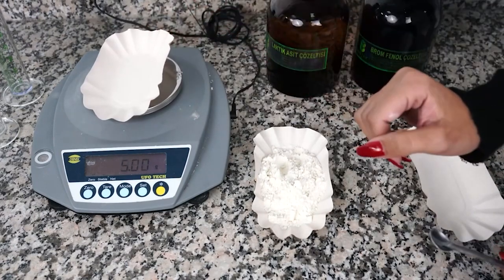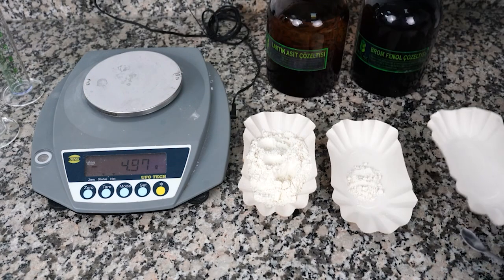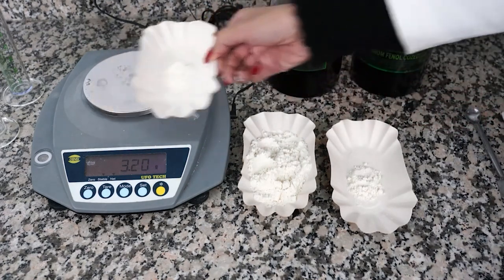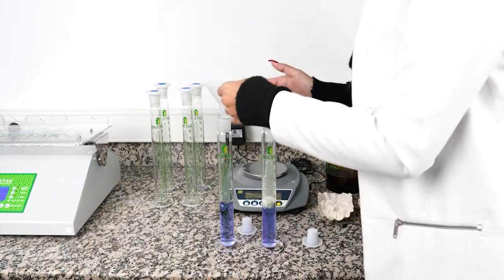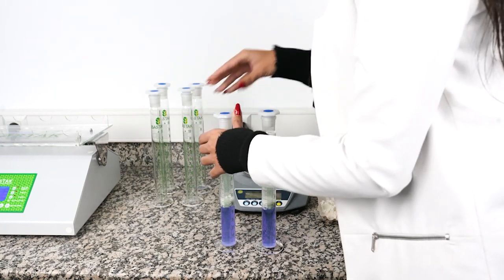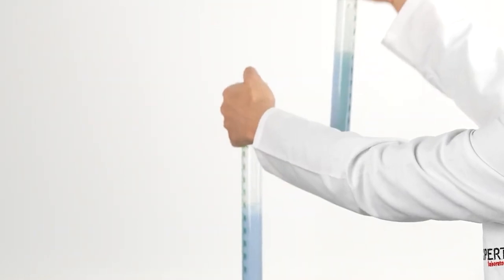Grams of the homogeneous sample from 4 to 5 different points of the sample are weighed according to 14% humidity. The same process is repeated for parallel analysis. Weighed flour samples are transferred to the sediment tubes using a funnel. The mouths of the sediment tubes are tightly closed with lids, and the tubes are shaken approximately 12 times for 5 seconds.